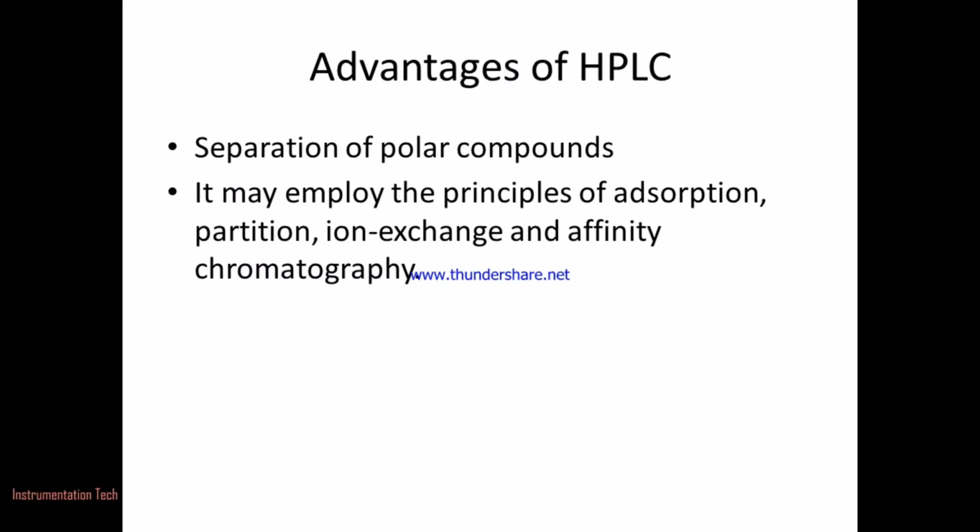Advantages of high performance liquid chromatography. First one, separation of polar compounds such as drug metabolites, which in general are poorly resolved by other techniques. Second one, it may employ the principles of adsorption, partition, ion exchange, exclusion and affinity chromatography.